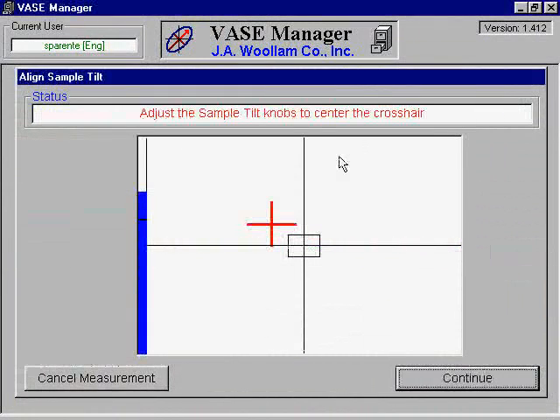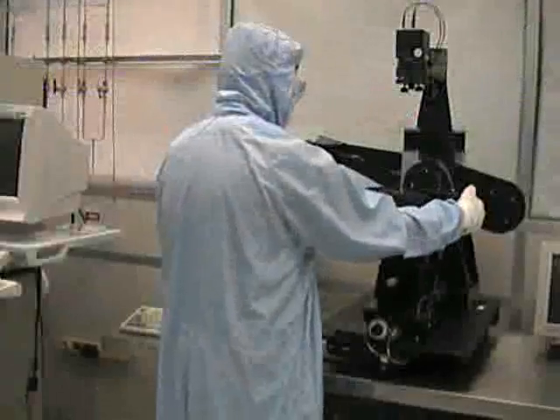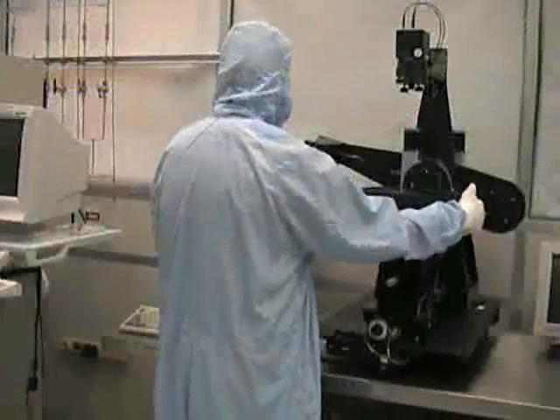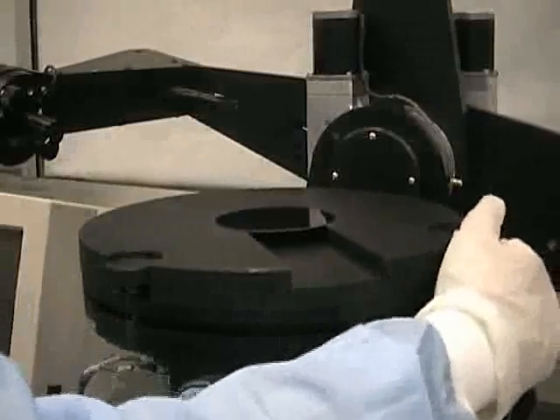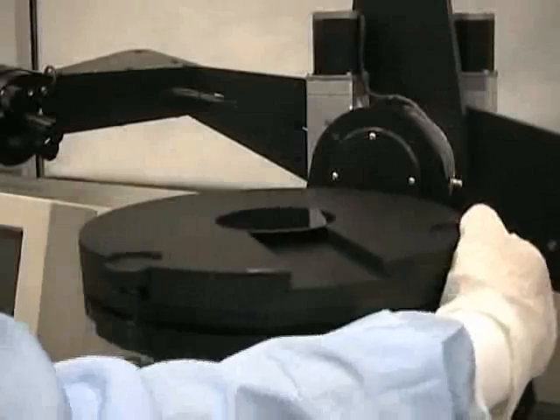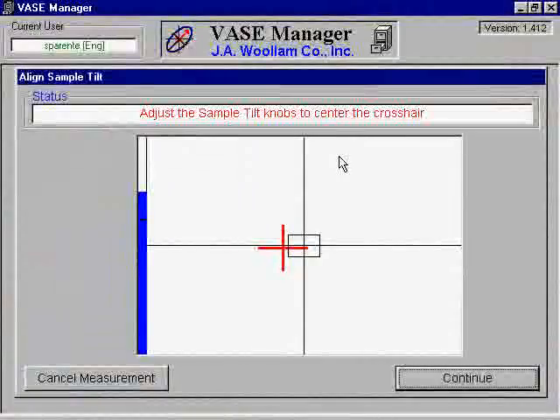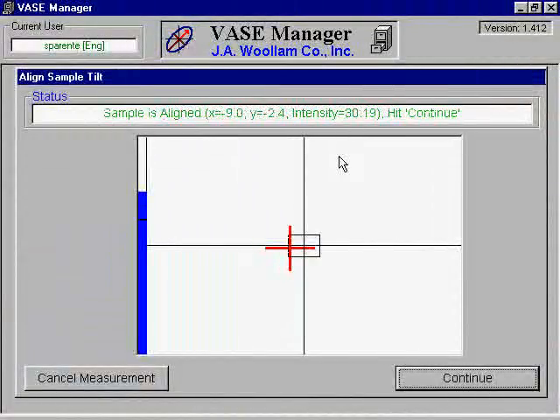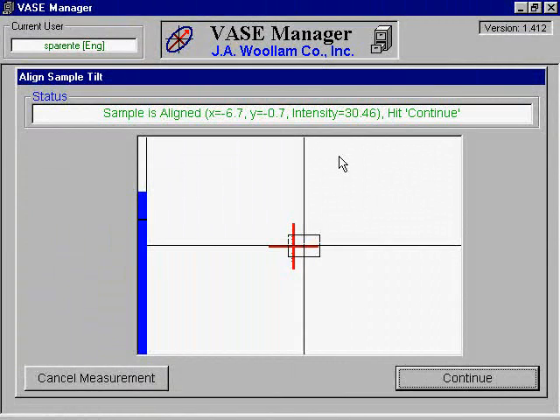The next screen will show a red crosshair somewhere on a pair of axes. Align the crosshair with the center of the axes by turning the alignment knobs located on the front and right side of the sample stage. Once the crosshair is inside the box, the coordinates will appear on the top of the screen. Use the alignment knobs to try to get the crosshair as perfectly centered as possible.